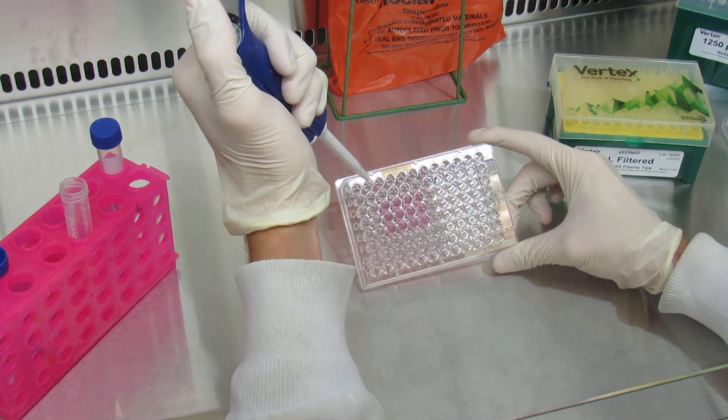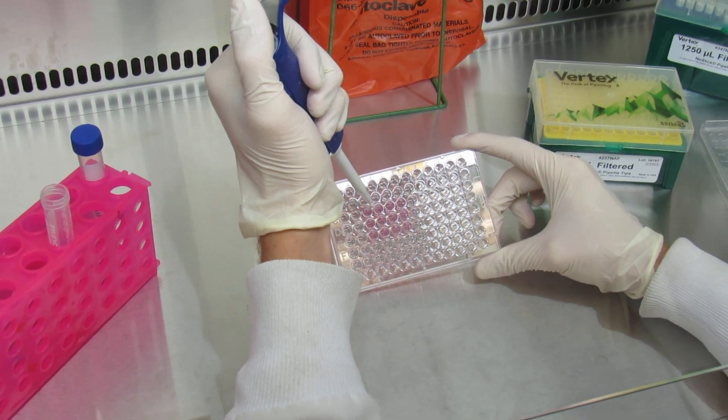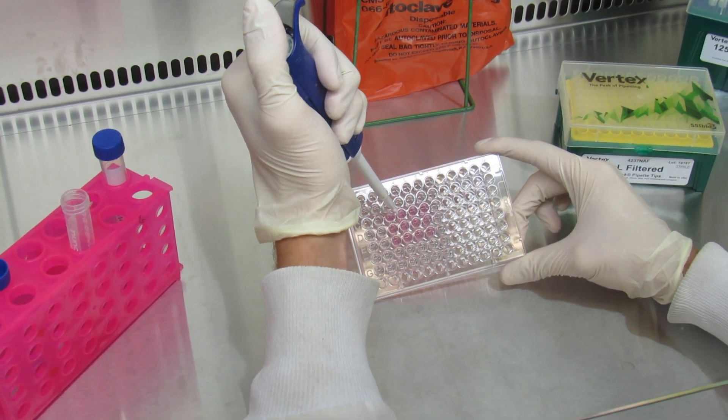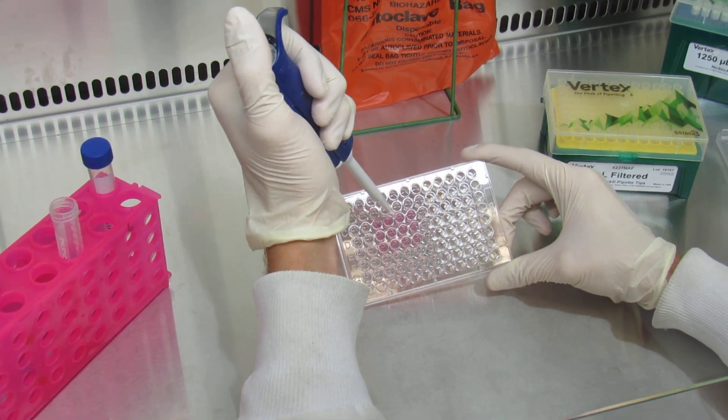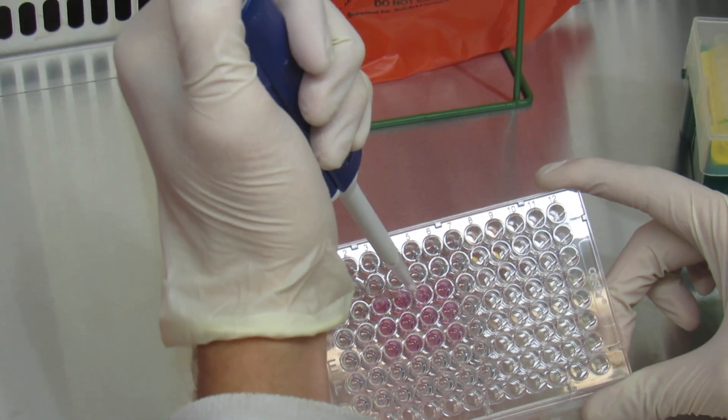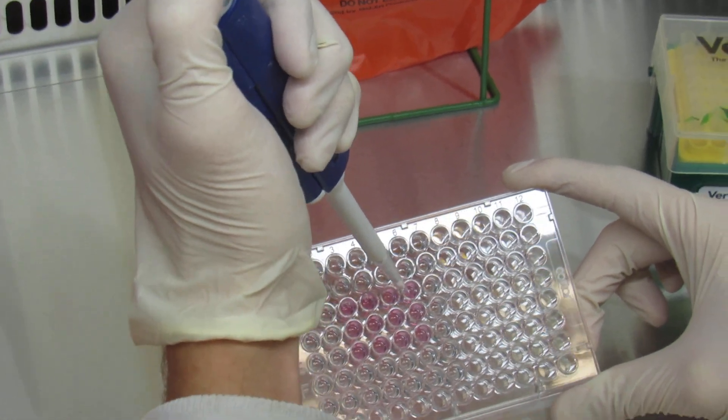Now you'll take 10 microliters out of that well and you'll put it into the adjacent well to the right side. You'll pipette up and down about five times. Do the exact same thing for the next one, and then the last one.